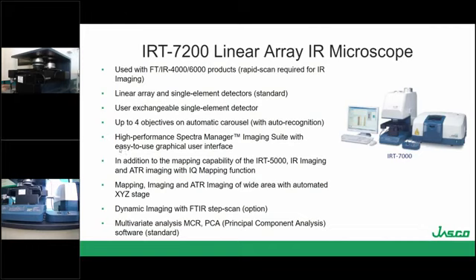Since this instrument is designed for imaging, the imaging software is included with this instrument. Of course, we can also do IR imaging, ATR imaging, and also the function of the IQ mapping. We have the option for dynamic imaging using a step scan, and the multivariate analysis, MCR-PCA, is also included in the analysis of the imaging samples.